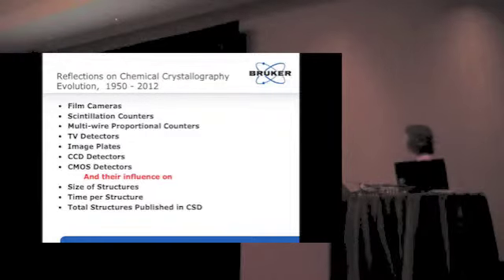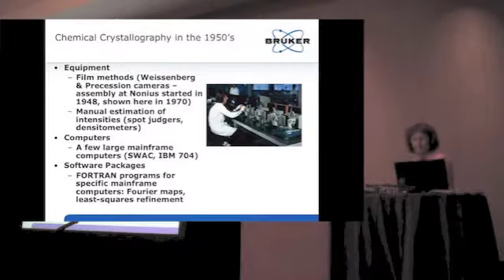And try to move through these different changes in the instrumentation and show their influence on the size of chemical crystallography structures, time per structure, and the total structures published in the Cambridge Structural Database.